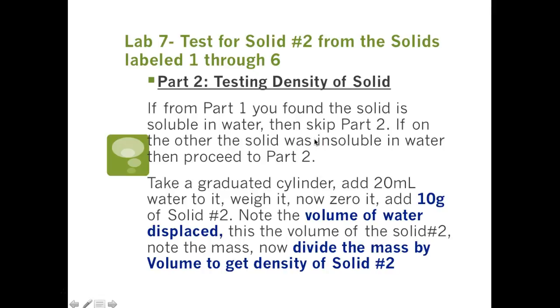if it completely dissolves into water, then there's no way you can determine its density by volume displacement. However, if it is only moderately soluble or almost insoluble, then you can use volume displacement to determine its volume. And since you know its mass, you can then take the mass and divide by the volume.